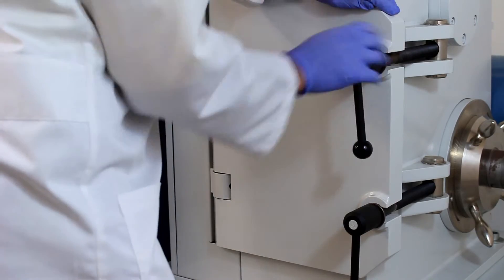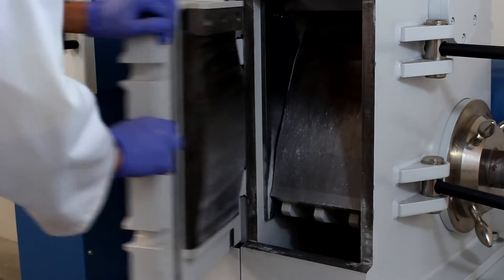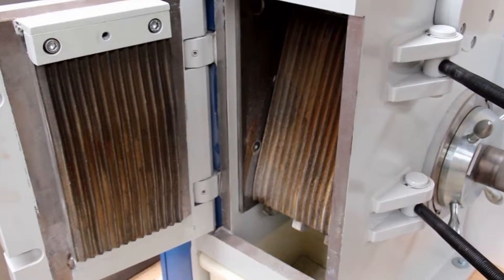The CM20i allows for easy access to the crusher jaws, either for cleaning or to replace the wear plates. Smooth and riffled wear plates are available in different types of material depending on the application.